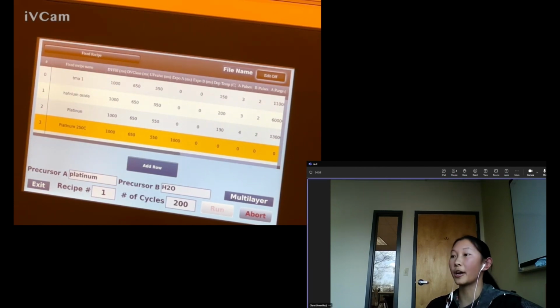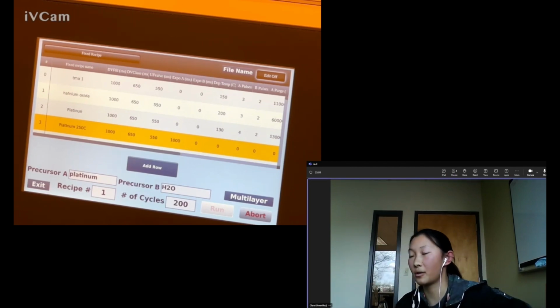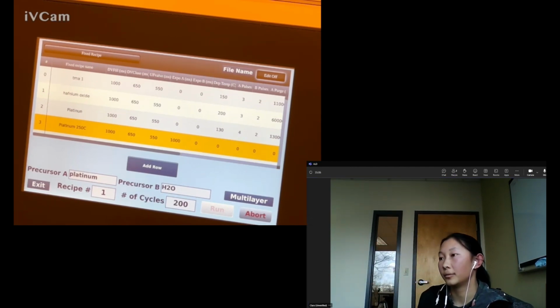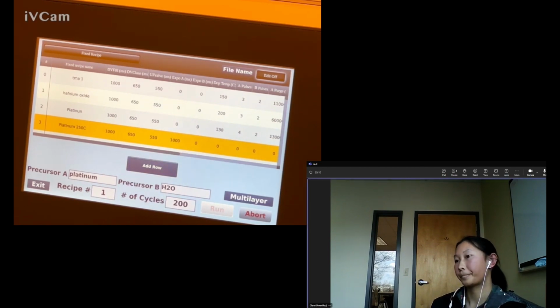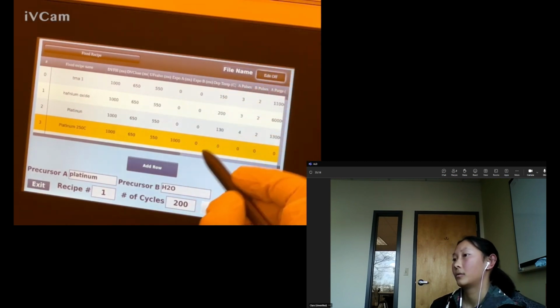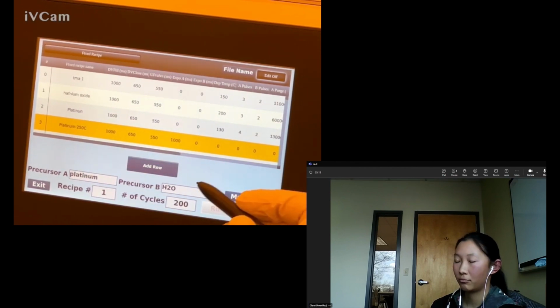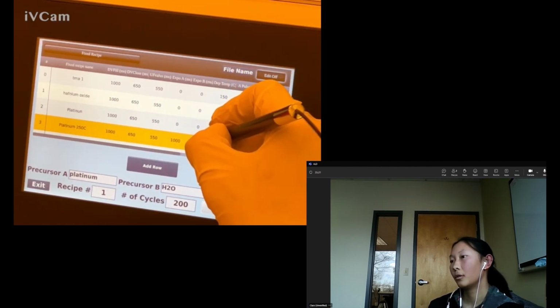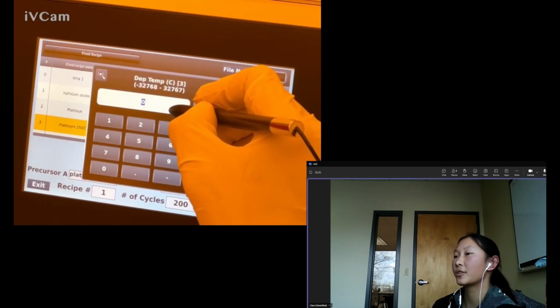So depending on what you're trying to do, you might use it, you might not. Or you can experiment with it as well. So keep the precursor longer in the chamber. And for a flat film, you don't really need that, right? Exposure B is water, so we don't need that. Step or temperature, for this it will be ozone, but you still don't need it.